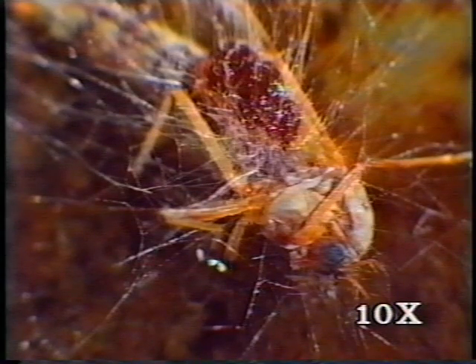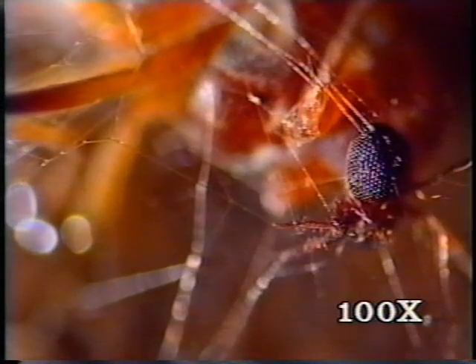As we zoom in, the hyphae are easier to see. The eye of the insect is located on the right. The fungus is using the insect as a food source, and then other organisms will eventually graze upon the fungi as a food source. We can see how the microorganism fungus decomposes the macrofauna insect.